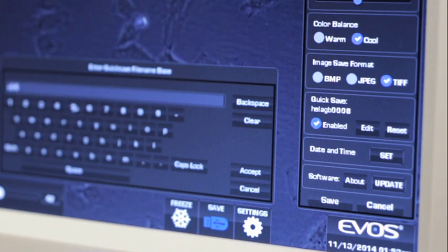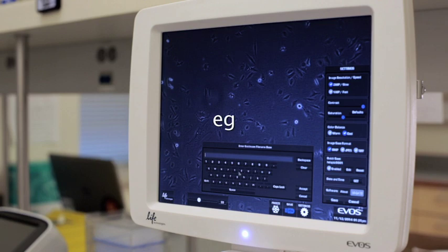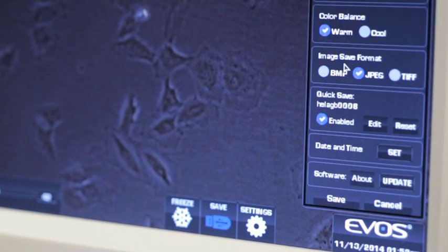Enter a base file name. The base file naming convention will be used in the file name beginning with underscore zero zero zero. Images can be saved in BMP, JPEG, and TIFF formats.